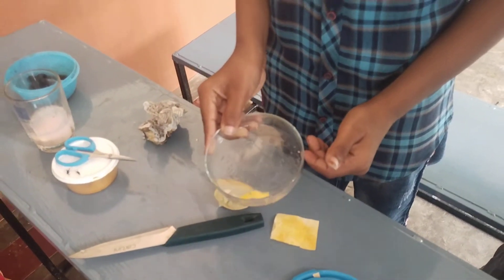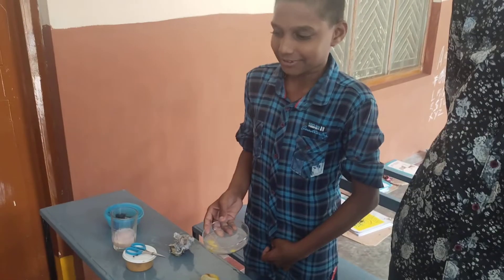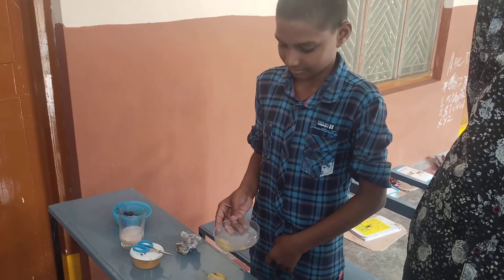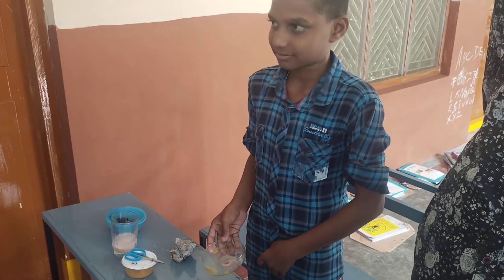Wait for 15 minutes. It shows no color observation. Thank you.